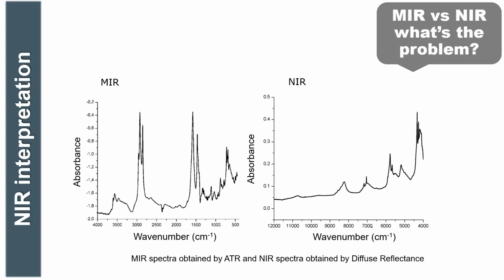In the past, several instruments were developed which operated in the mid-infrared region, as specific chemical bonds could be ascribed to the peaks. In contrast, NIR spectroscopy was neglected for a long time, as very little information in that spectral region could be deduced due to the broad, superimposed, and weak absorption bands, which made it difficult to interpret. With the advance in multivariate data analysis tools, it became easier to analyze the spectra.